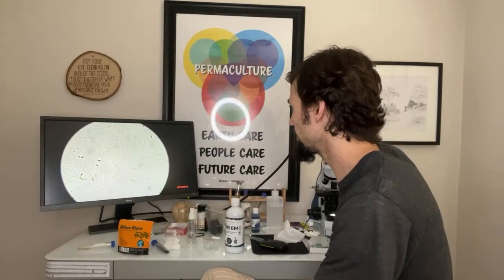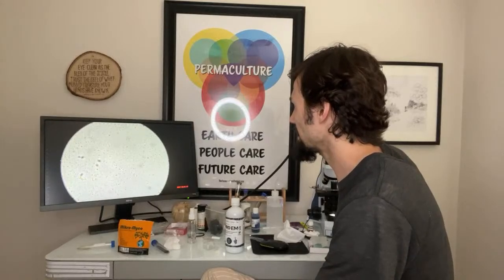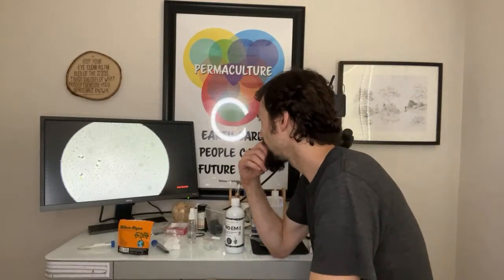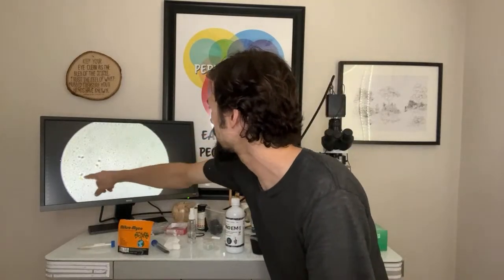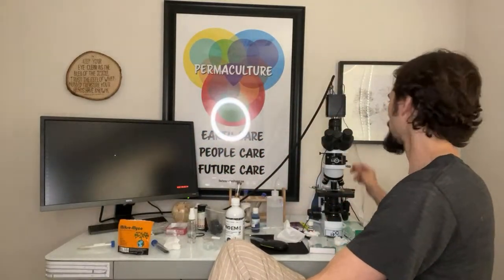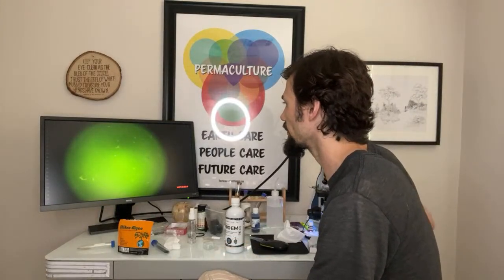Oh man, so this is amazing. The bacteria in this, they really are smaller and more numerous than most of the other preps. You can see a lot of the yeasts. And if we actually turn out the lights, you can see the yeasts and how they're lit up.